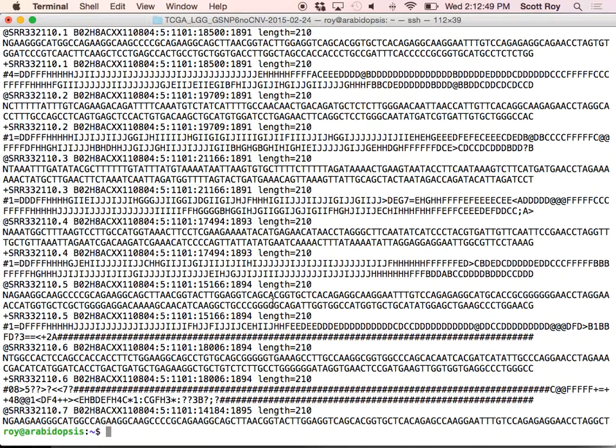And I think that's probably where we'll end this tutorial. That's a tutorial on how to find and download data from SRA.